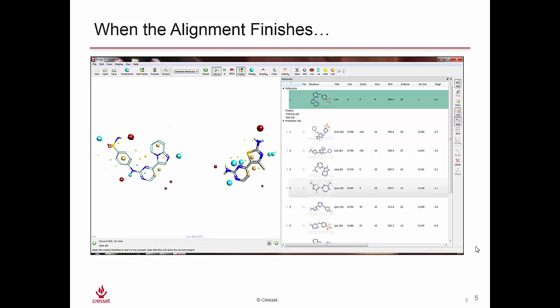When the alignment finishes, what we see in the Torch panel is we have an alignment score—the similarity score which is 50% fields, 50% shape. It's worth mentioning that we are aligning on the field points, not on the substructure or on the positions of the atoms.